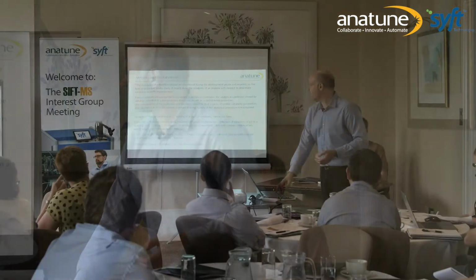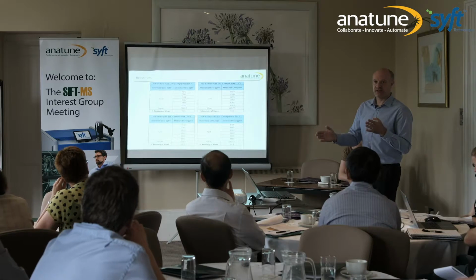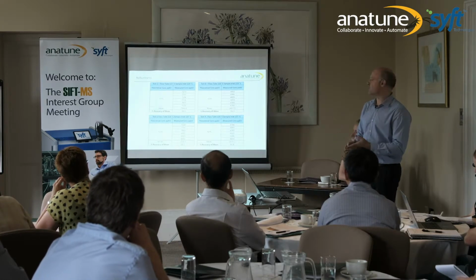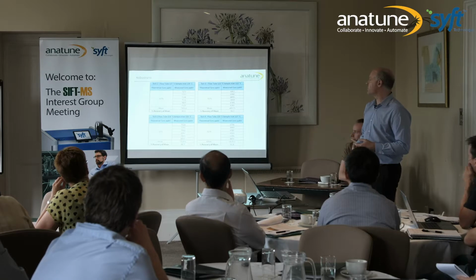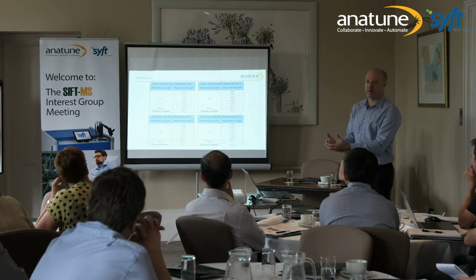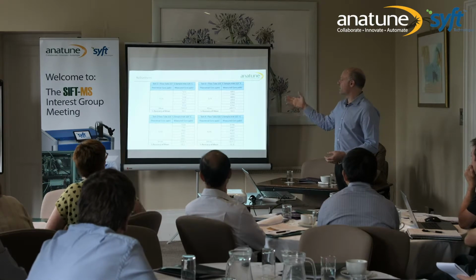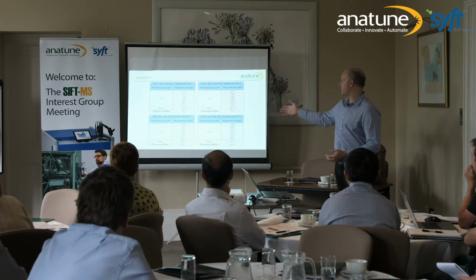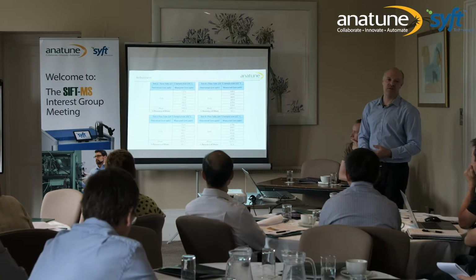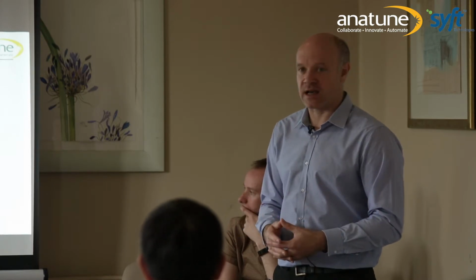So for the robustness, the flow tube and the inlet temperature were varied based on the tolerance that the instrument would sit in: plus or minus 7 degrees on the flow tube, plus or minus 7 degrees on the inlet. Again, using a prepared bag standard from the gas generator, run the 7.2 ppm standard 6 times and look at the recoveries, and you can see again we're at 90% plus recoveries. So even with this variation in temperature that we would expect over the measurement time of the method, you get very good recovery. So again, the method is actually robust.